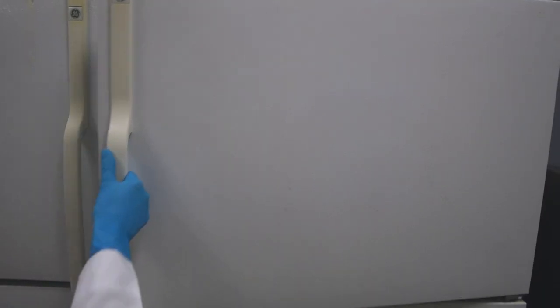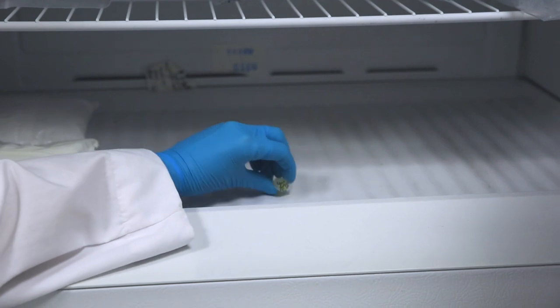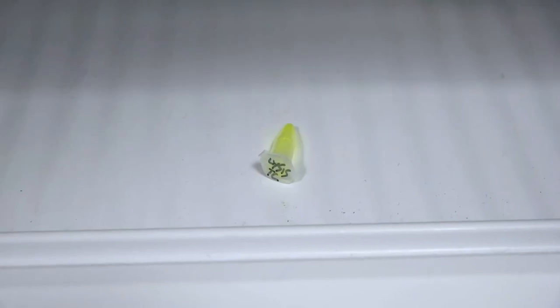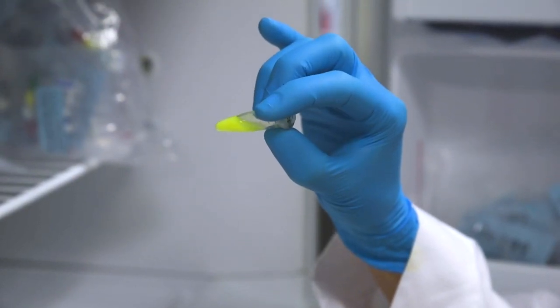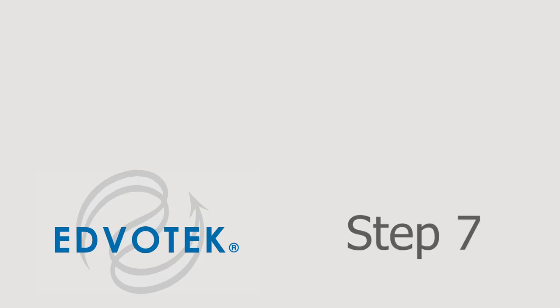Step 6: Place your microcentrifuge tube containing the GFP cells into a minus 20 degrees Celsius freezer for 15 minutes or until frozen. Lay the tube on its side to ensure rapid freezing.